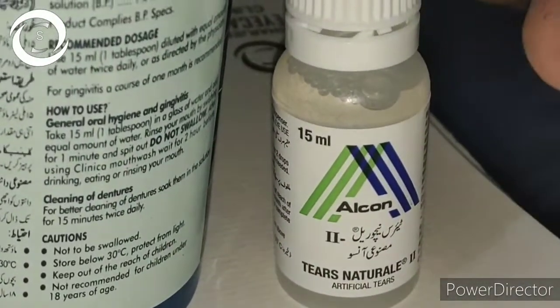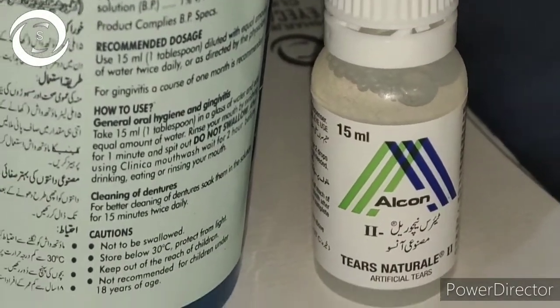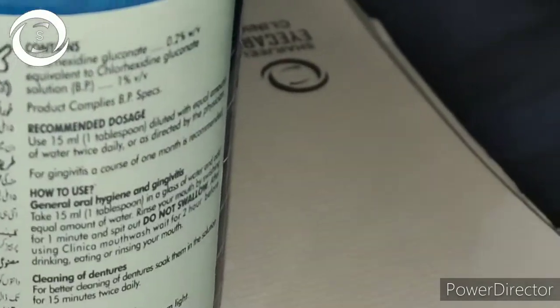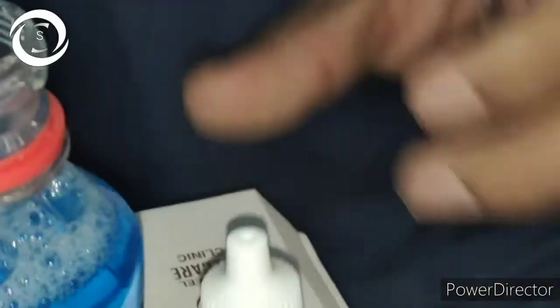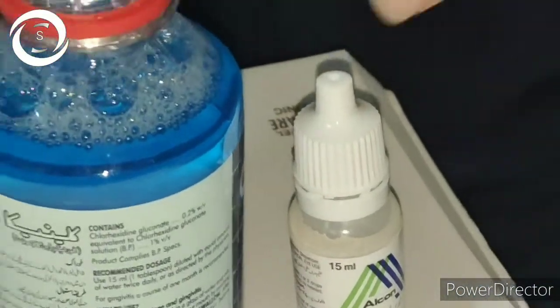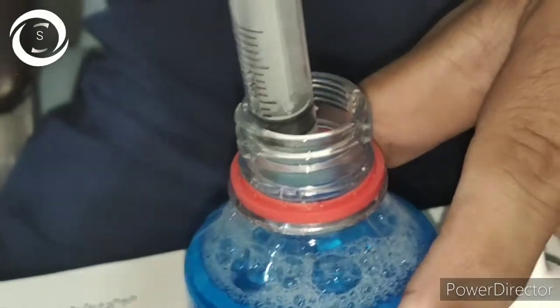Now we have the mouthwash bottle, and you can see here the concentration of chlorhexidine is 0.2%. We have also taken artificial tears with the less toxic preservative polyquad, in Tears Natural.